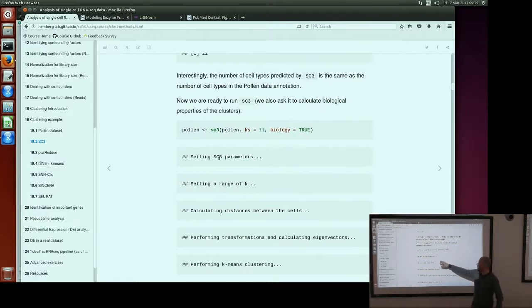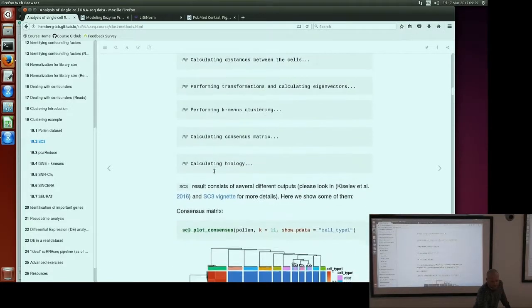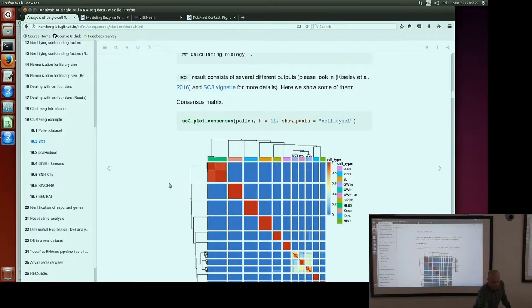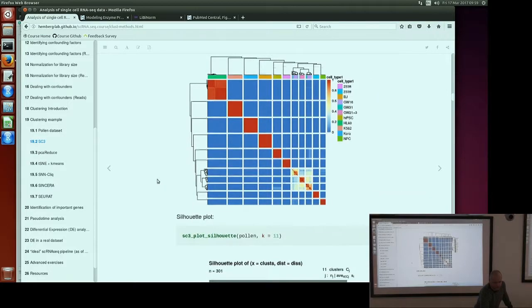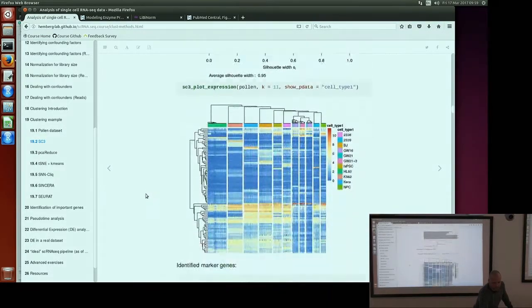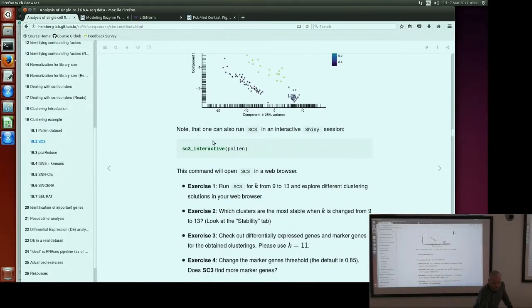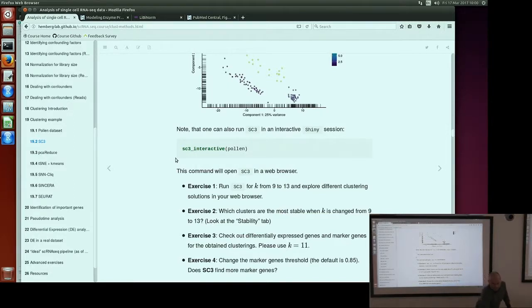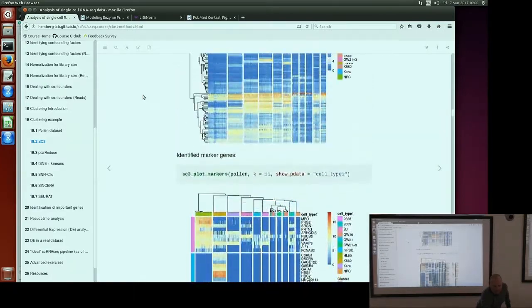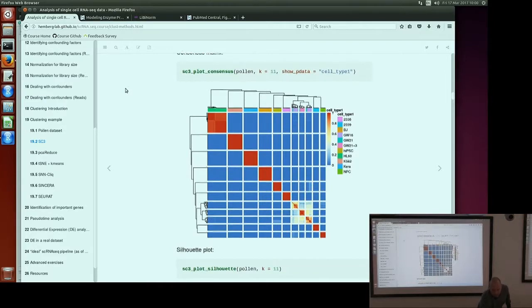If you run the SC3 function, you will see quite a lot of output. Probably the best way to explore results is using the interactive session. If you run SC3 interactive pollen, it should open a new session in the web browser and you can see all the images I'm going to show you now. Let me know when you open the interactive session in the web browser.